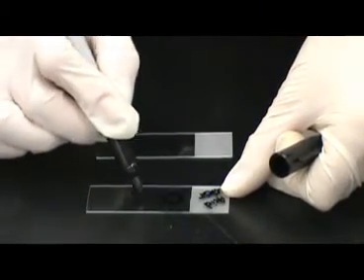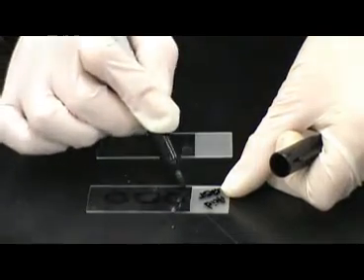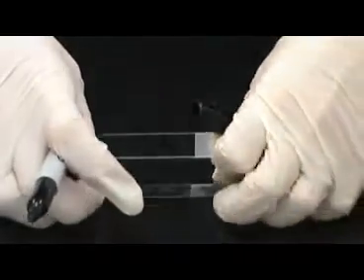Draw 3 circles on the slide. One circle will be used for a positive control, another for a negative control, and a mix of the 2 bacteria will be placed in the middle.